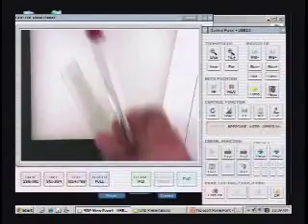A couple of points when you're preparing these slides. This membrane can be somewhat fragile, and when you put these labels on, you don't want to place it and then think, oh, I need to replace it, because you don't want to tug at the membrane or poke it. If you poke it, you can get water in there when you're doing your staining, or any kind of liquid for that matter, and then it will be really hard to dry out that slide, and it's going to affect your cutting when you have this water floating around. That also goes for when you actually spot your sample on there. You don't want to just put your pipette tip right on that membrane and put the spot. Be very gentle.